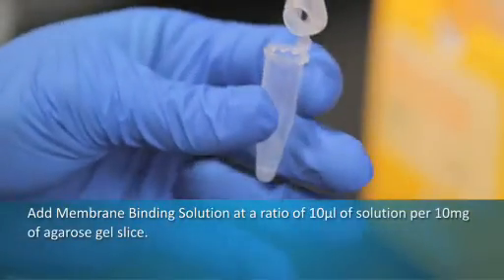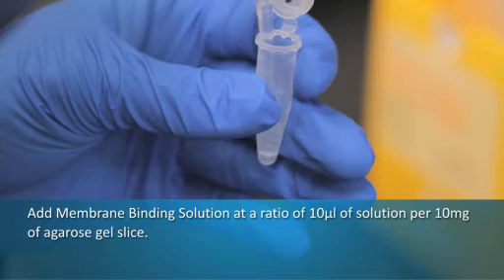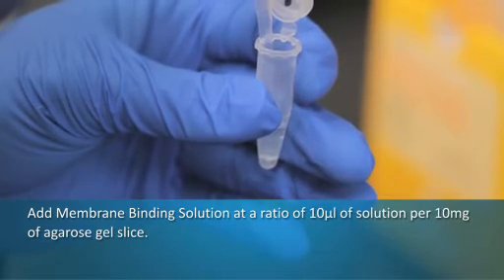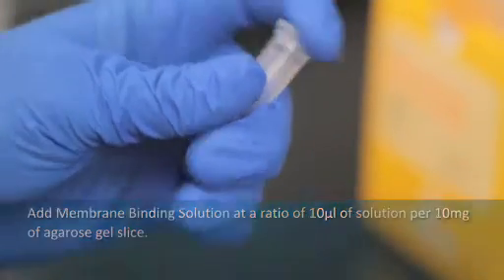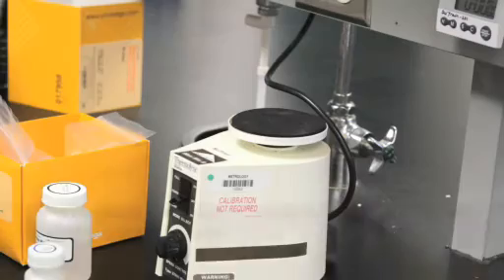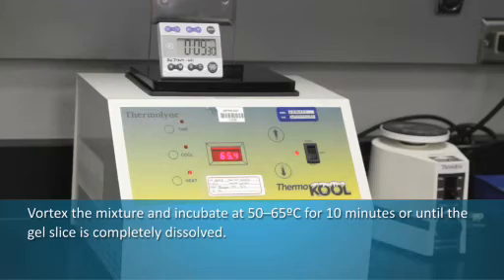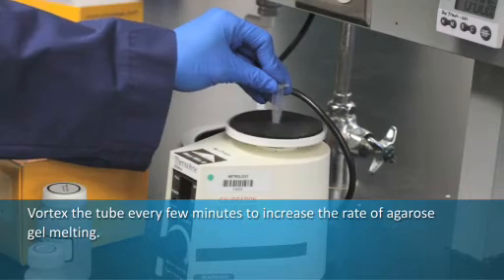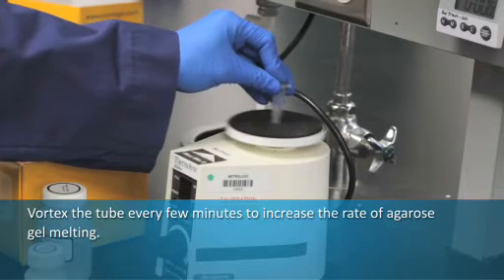Add membrane binding solution at a ratio of 10 microliters of solution per 10 milligrams of agarose gel slice. Vortex the mixture and incubate at 50 to 65 degrees Celsius for 10 minutes or until the gel slice is completely dissolved. Vortex the tube every few minutes to increase the rate of agarose gel melting.